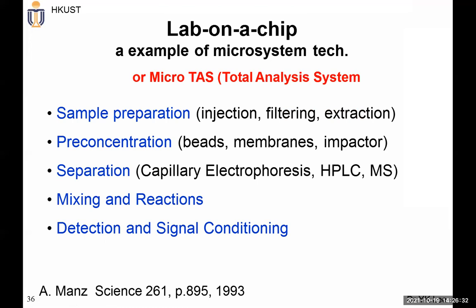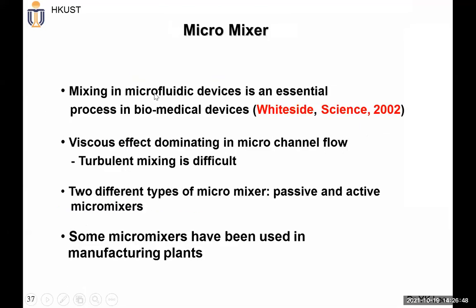The viscous force will be much more important. Why? The drag force, due to this kind of friction, especially in liquid flow, can create some big issues. So in a microfluidic device, mixing is much more difficult to achieve. In this case, we need to think about how to achieve mixing.